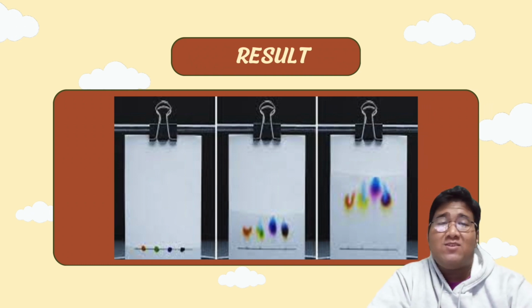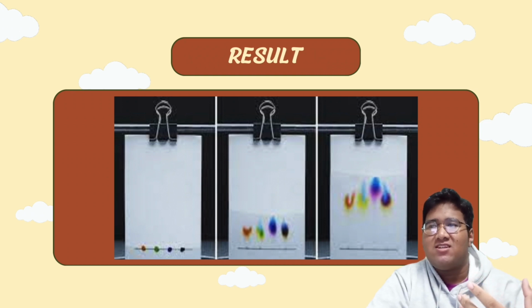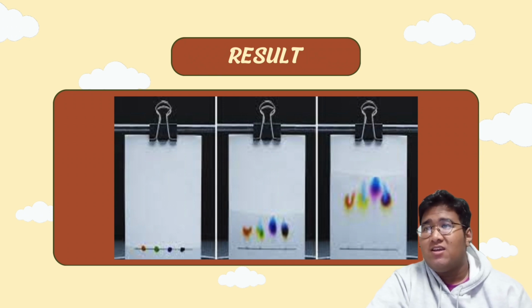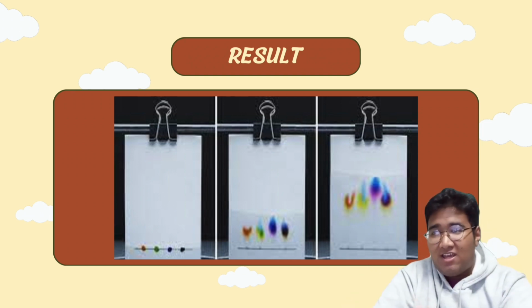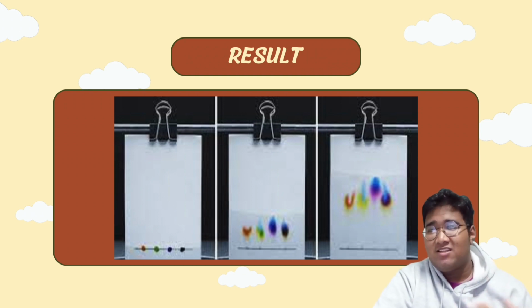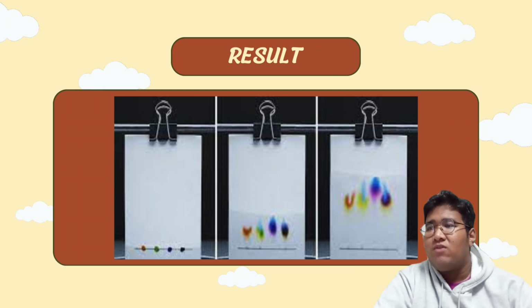Bismillahirrahmanirrahim. My name is ABDUL AZIZ, and today I would like to explain the result of paper chromatography. As you can see here, I put three pieces of the results: the beginning, the middle of the experiment, and the last result.